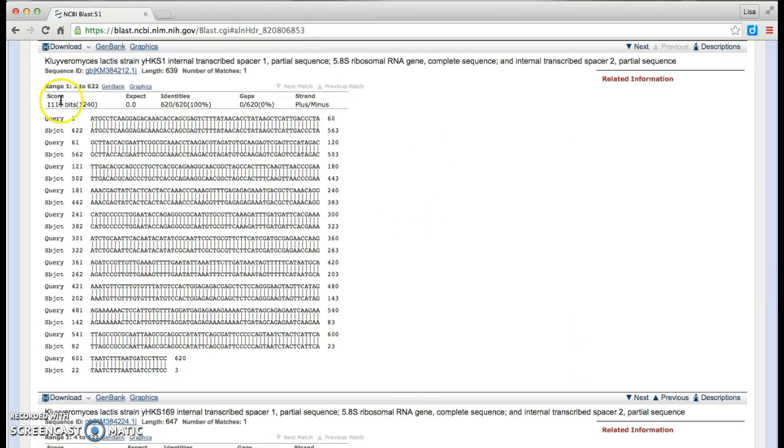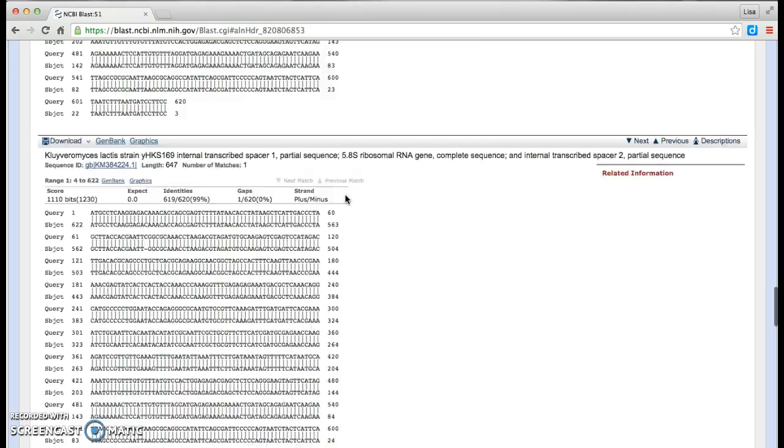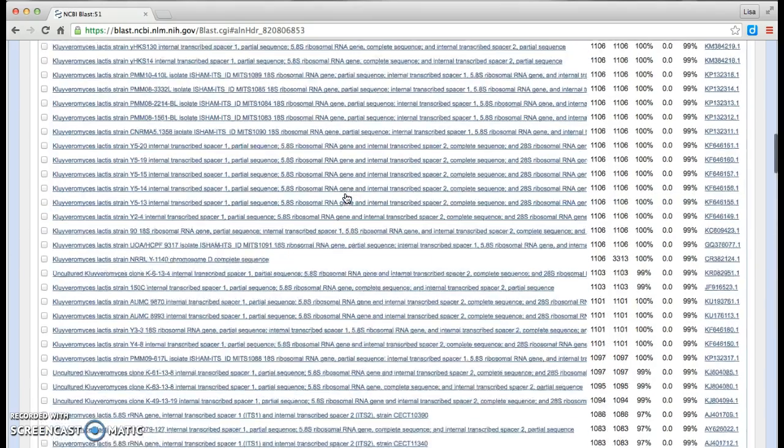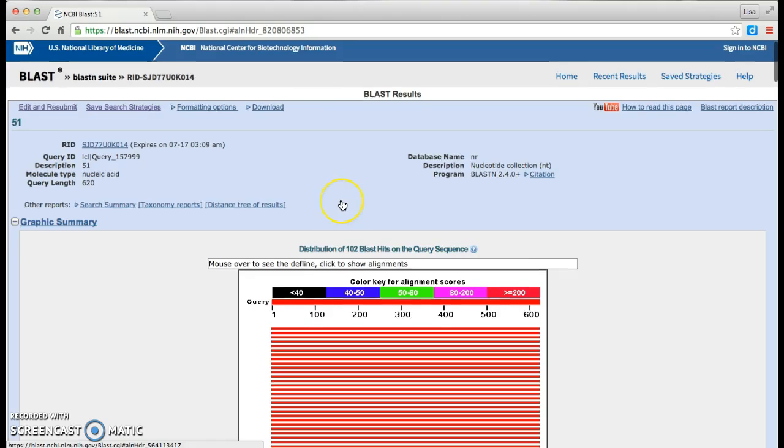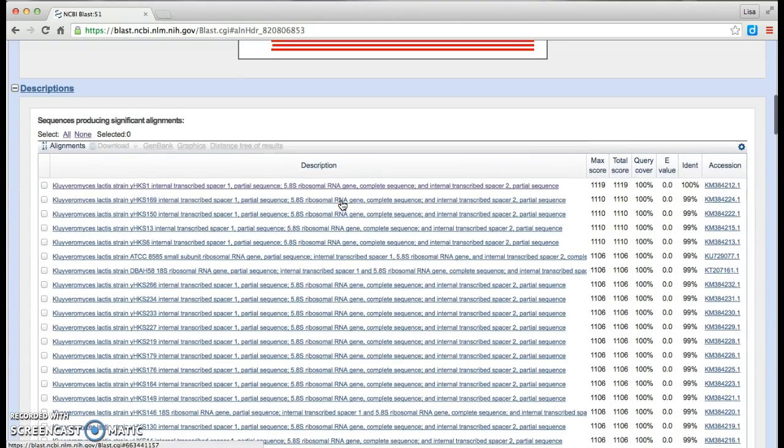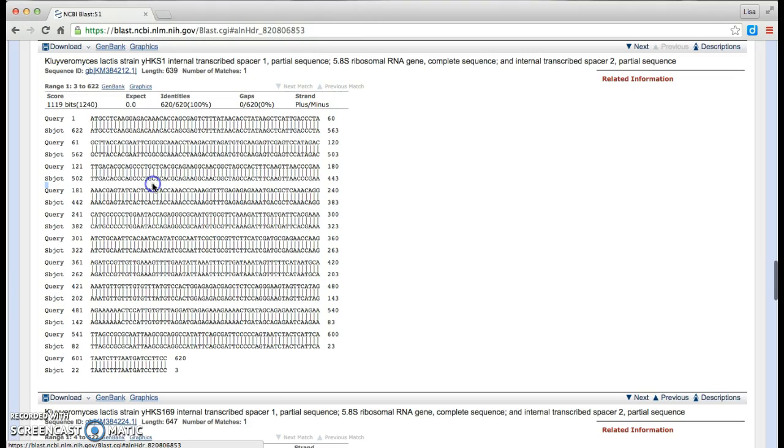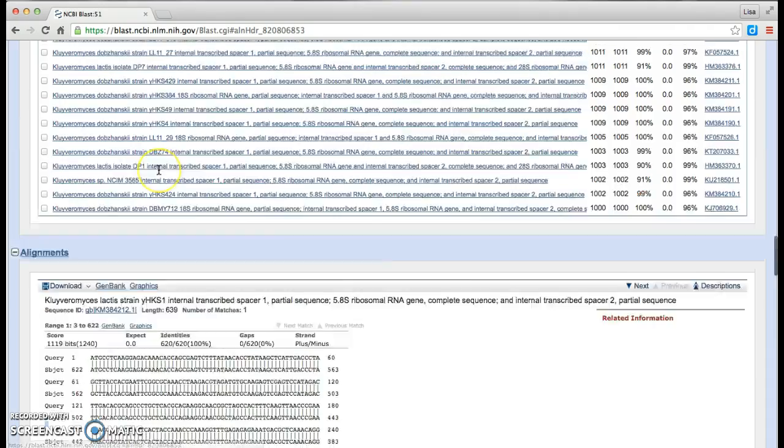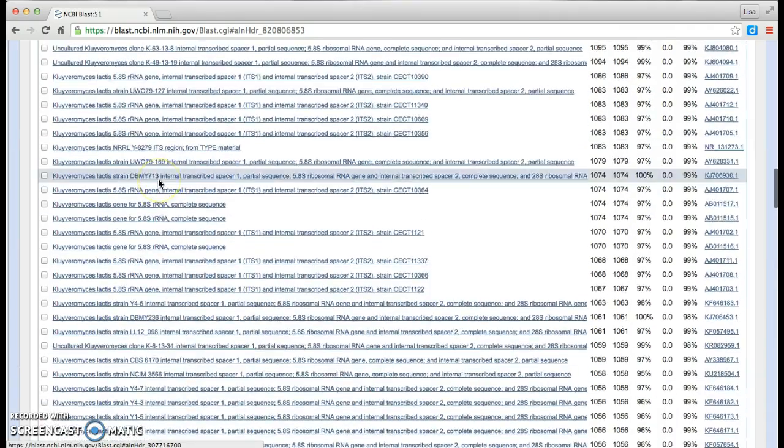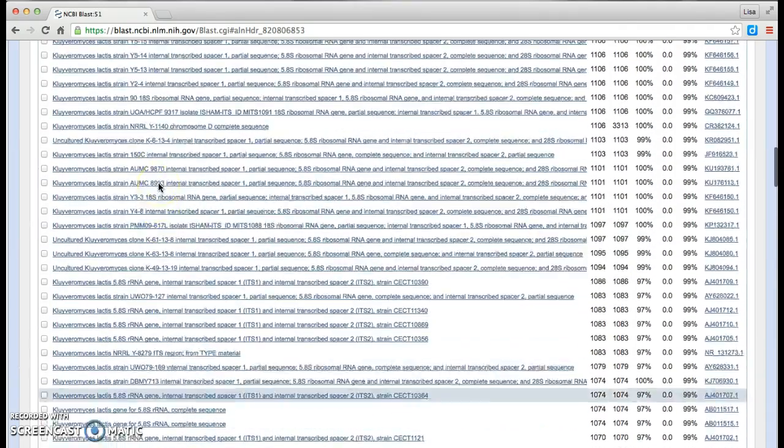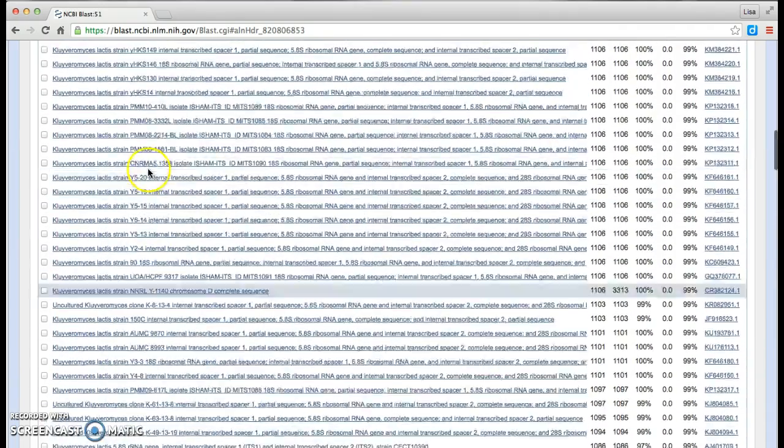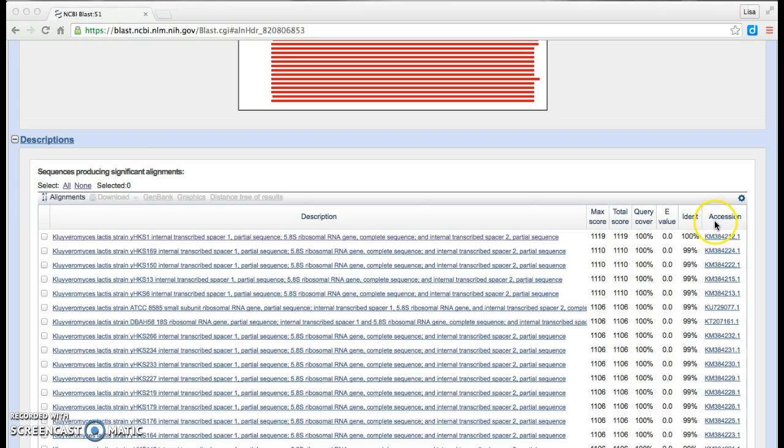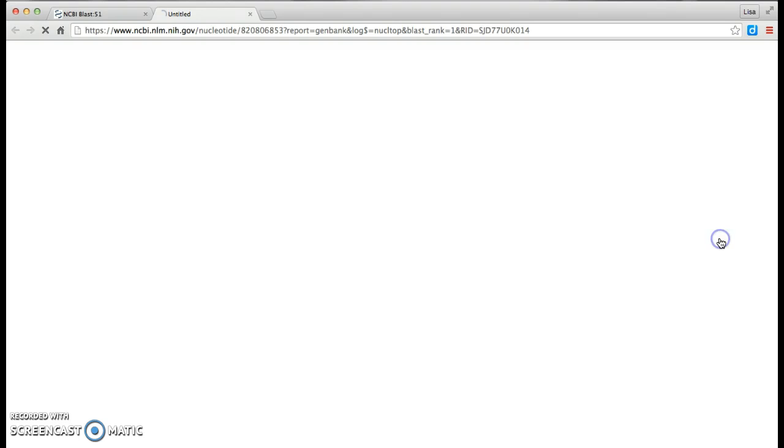I'm finding out that it's Kluyveromyces lactis strain, the sequence number. It looks like this was right from the same lab that I work. So that's kind of exciting that it's in this database. And I want to learn more about the species itself. So up here you see an accession number. I'm going to select that. And it brings me over to the species.